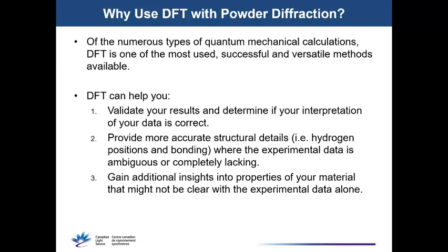DFT can be very complementary for powder diffraction work, and more broadly, just for experimental work in general. For many experiments, it's difficult to validate your results. You need some way of critically looking at them to determine if they're correct, and DFT can be an excellent tool for doing this. And DFT can actually provide better structural details than the experiment in certain circumstances.